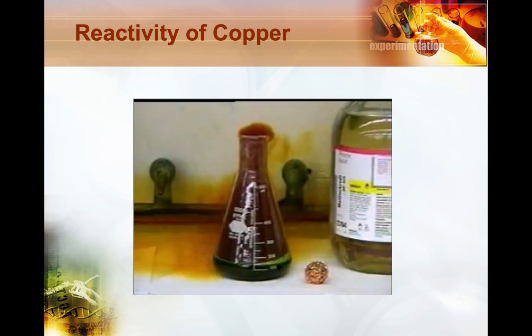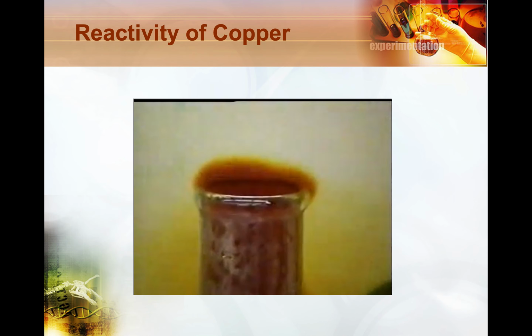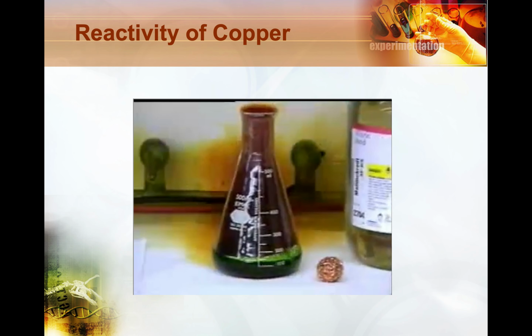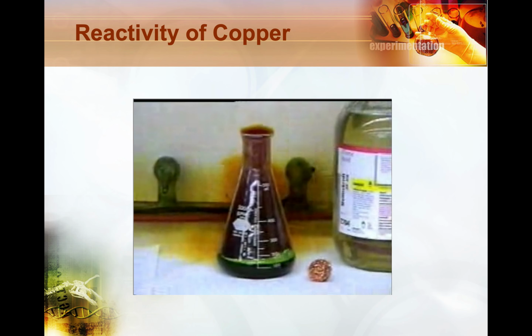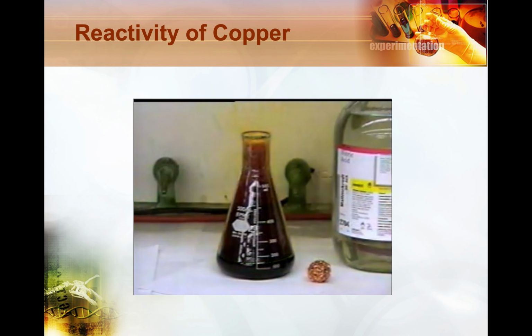So while this is happening, be sure in your notebooks, write down what you see, describe everything. Describe the bubbling, describe the color, describe whether it's a solid, a liquid, or a gas. And then after this, we'll show the next step once it's finished. You can see it slowly stopping.